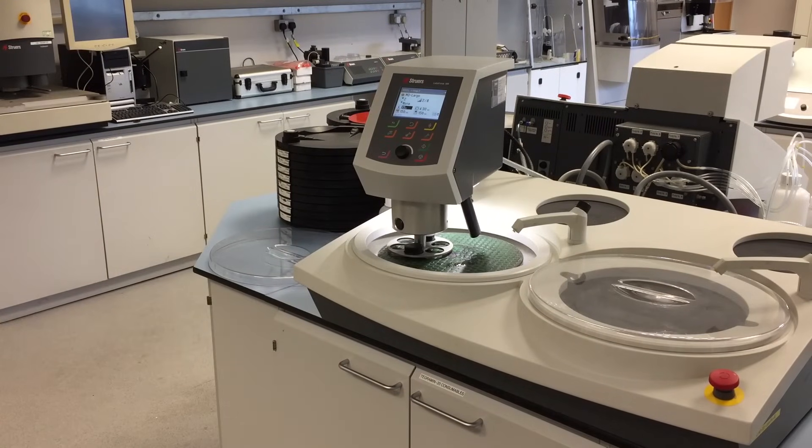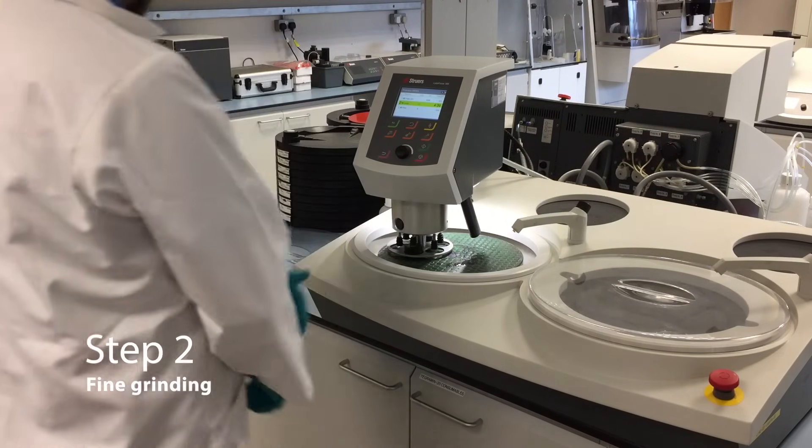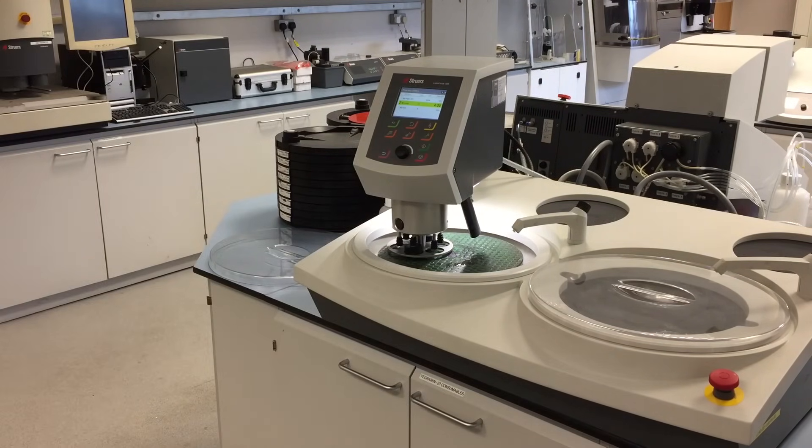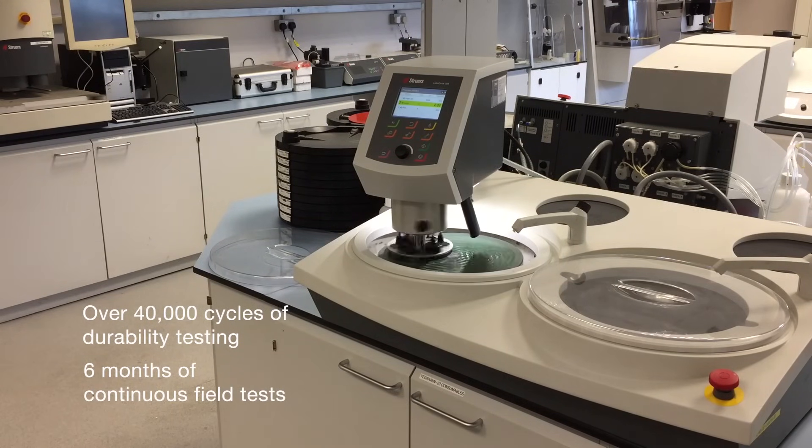The fine grinding stage. The LAVO system has the endurance and speed you need to keep up with 24/7 throughput, enabling faster and more reliable preparation of specimens. Designed with corrosion resistant and impact proof materials, it is well suited for the demanding work environment. It has undergone more than 40,000 cycles of durability testing and has been subject to 6 months of field tests.